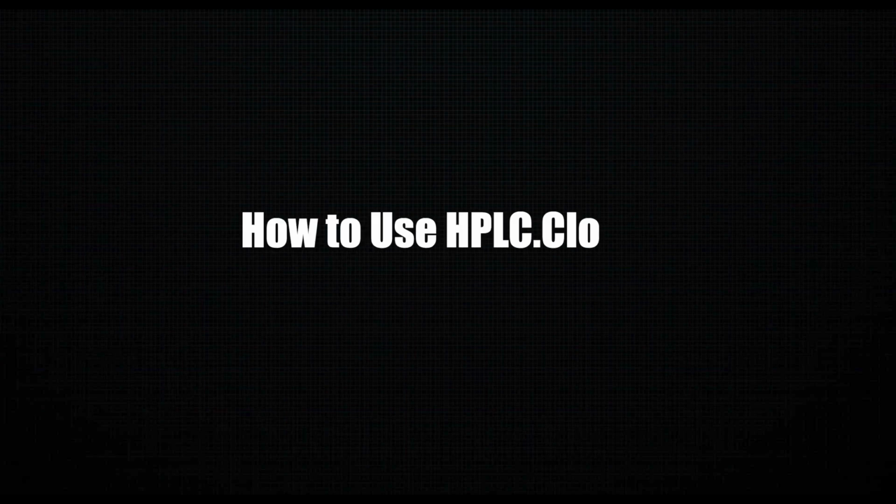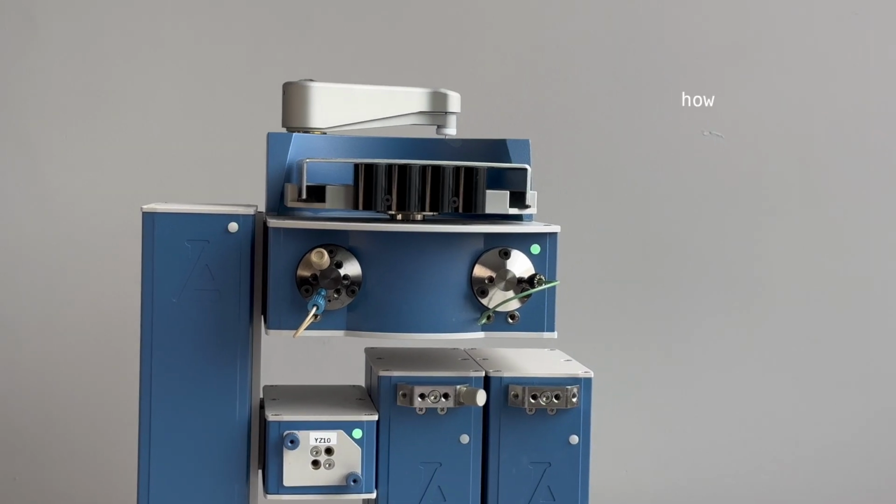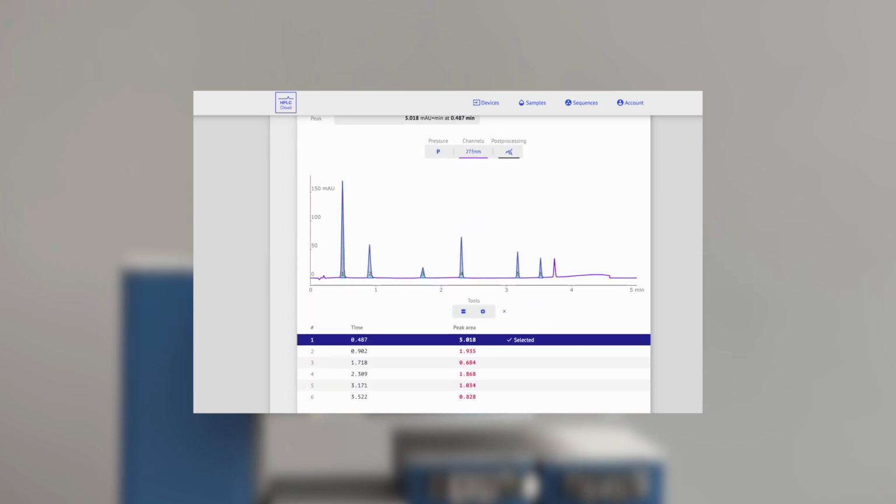How to use hplc.cloud. Hi, in this video, I will walk you through how to use hplc.cloud to perform your chromatographic analyses effectively. Let's get started.